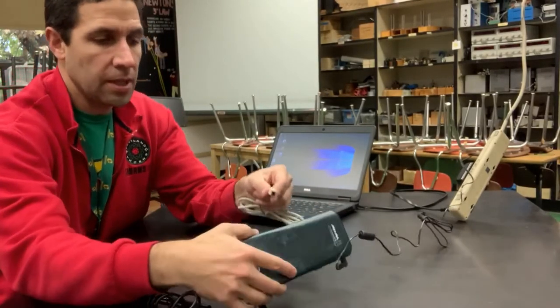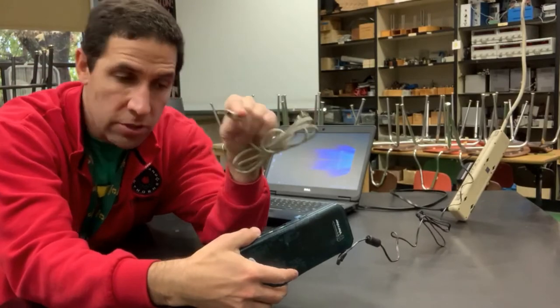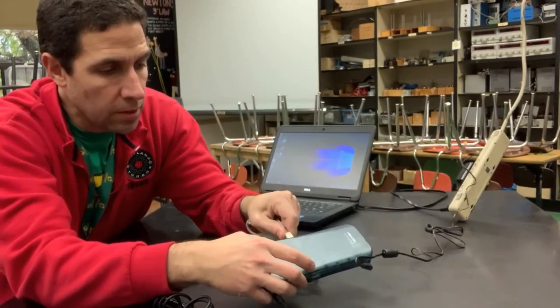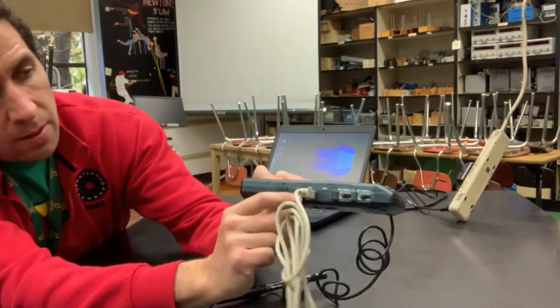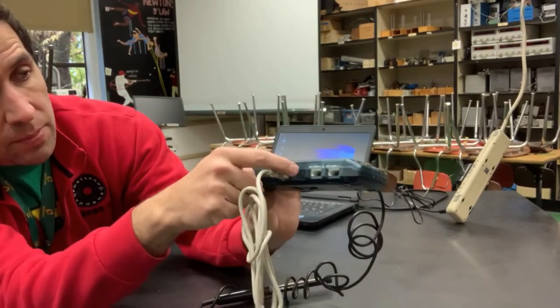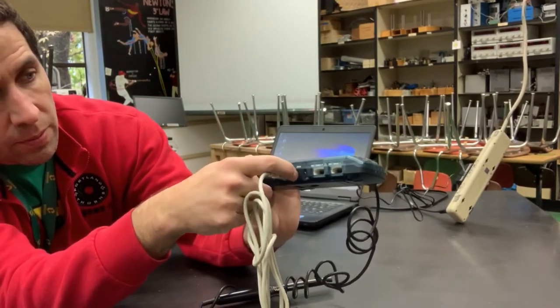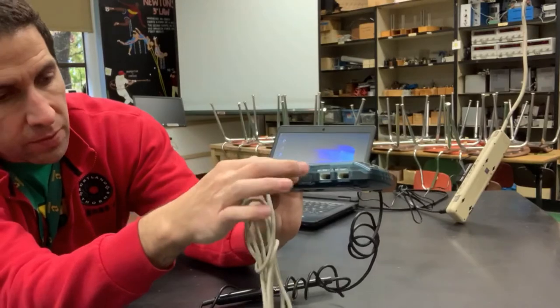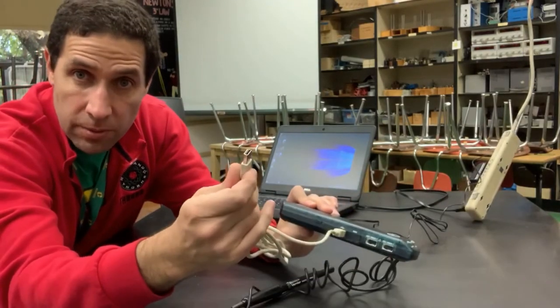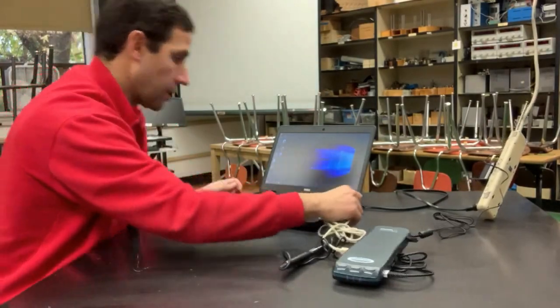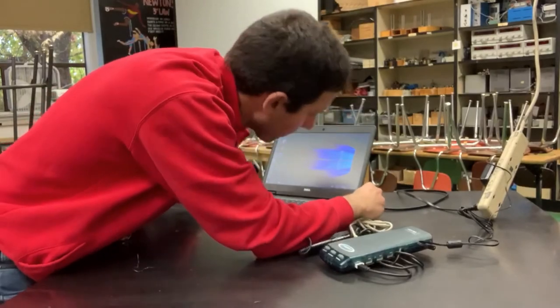So what you're going to do is you're going to take one end which is kind of like a squarish looking thing. It's going to go in here. You can see here this sometimes slides over. There's a little cover plate that slides over. You might have to slide the cover plate over. Then the other end is USB and that will just go wherever the USB is located.